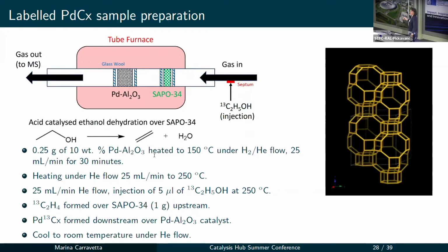As we saw during the earlier part of my presentation, but also the previous presentation, this will lead to the dehydration reaction, so we can generate ethylene in situ. Ethylene is usually used to generate the palladium carbide. So after going through this, the ethylene generated on the fly went onto the supported palladium nanoparticles, and then the leftover gas went out.